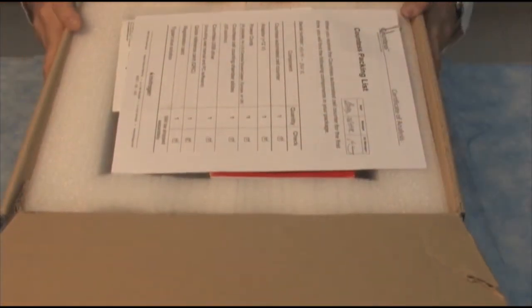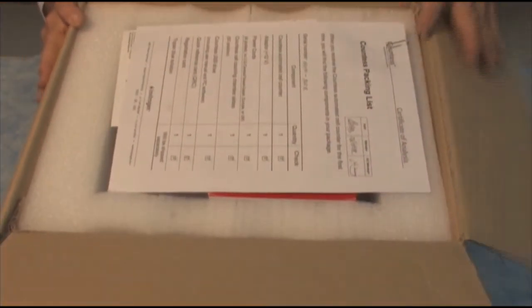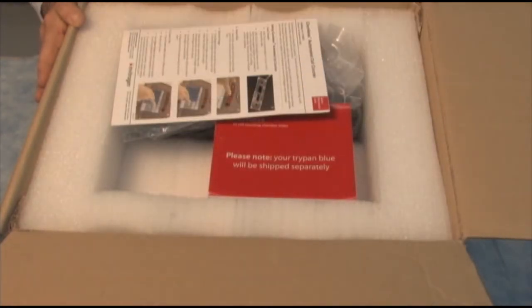So as I open the box, let's see what's inside. First thing I see is there's a certificate of analysis with a packing slip, and I'll pull that and set this aside.